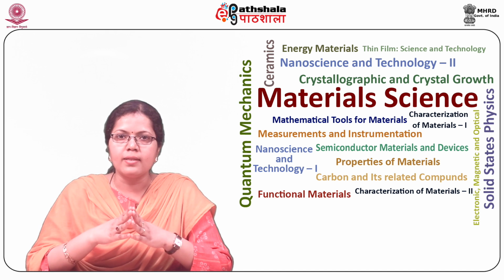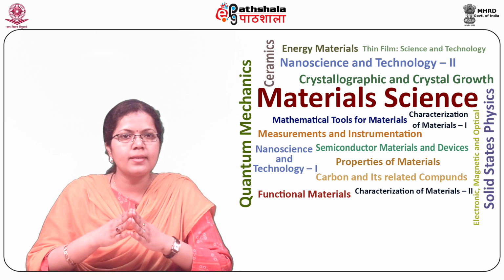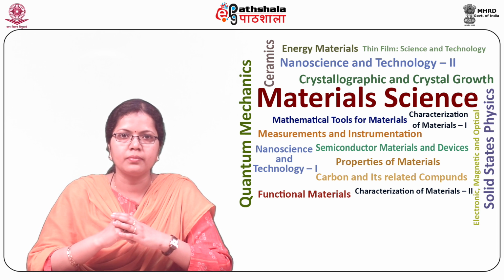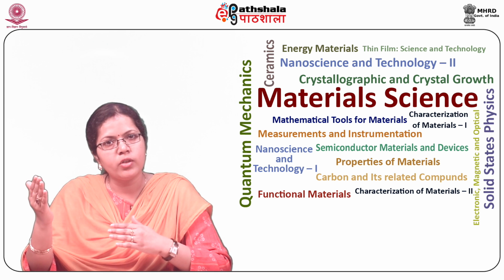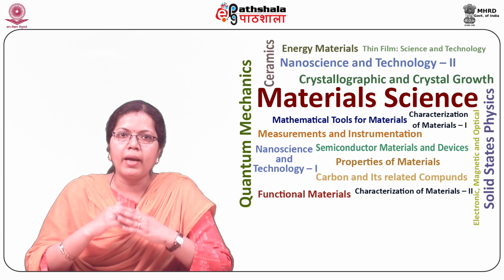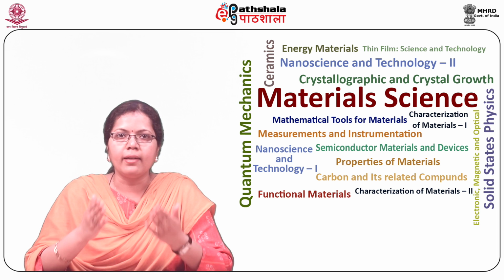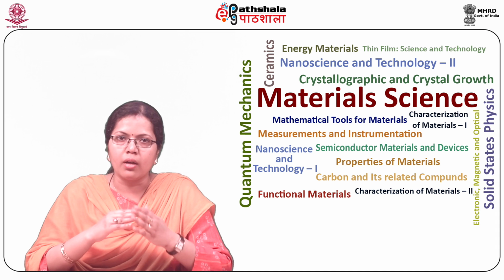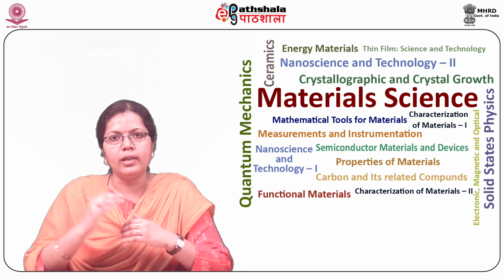The objective lens is located closer to the sample. It magnifies the sample and produces the real image. The real image is then projected up the body tube into the oculars. The ocular again magnifies the sample by 10x and creates the final image. The total magnification achieved is the product of the magnifying power of the objective and the ocular lenses.